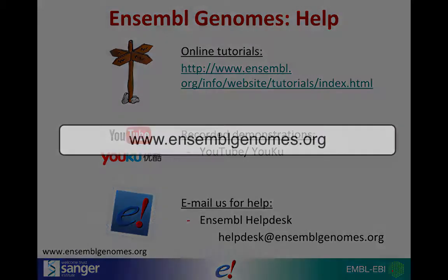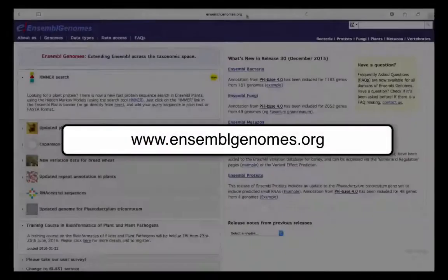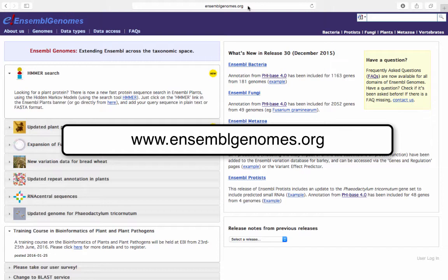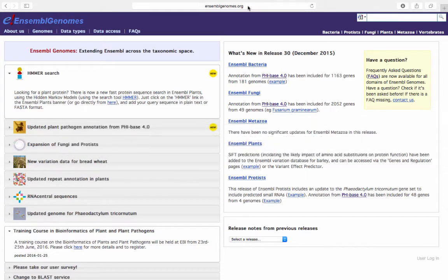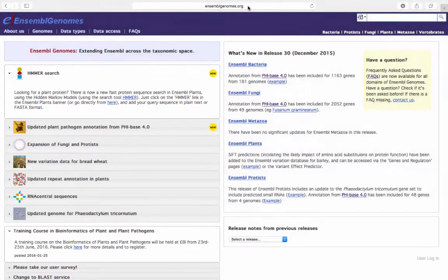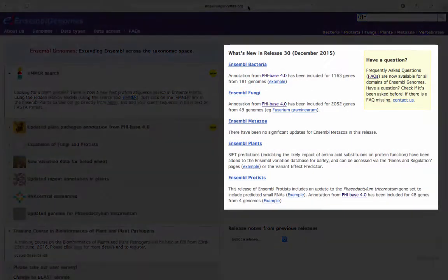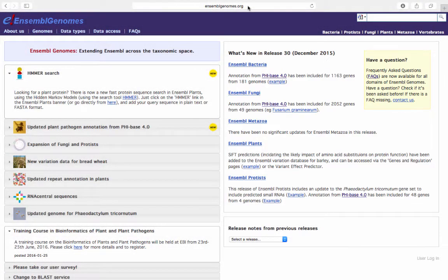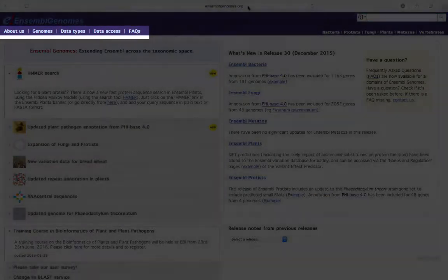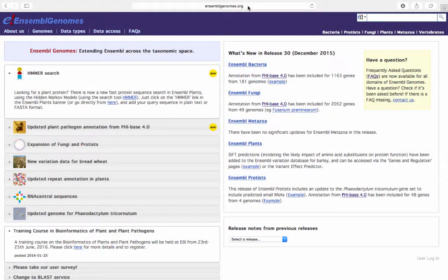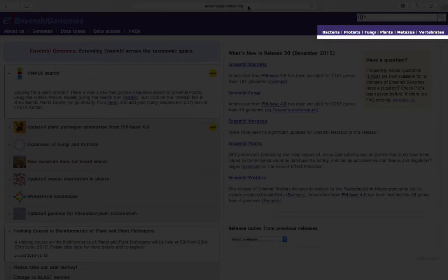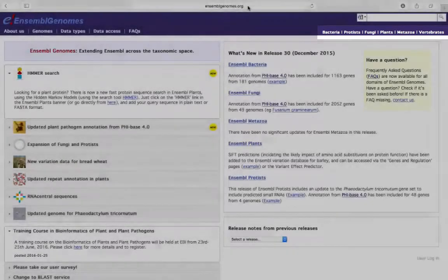We will now browse Ensembl genomes. Go to the main page at www.ensemblgenomes.org. Here you can find information, news and help about Ensembl genomes, as well as links to the taxa-specific pages for bacteria, protists, fungi, plants and metazoa, as well as the main Ensembl page under Vertebrates.